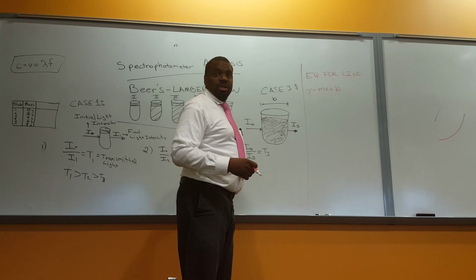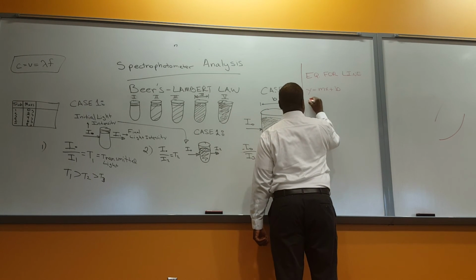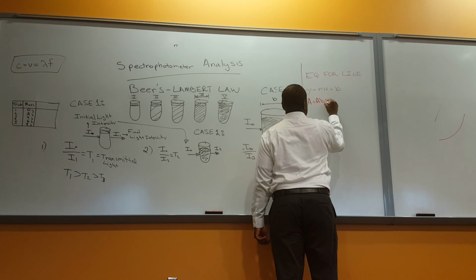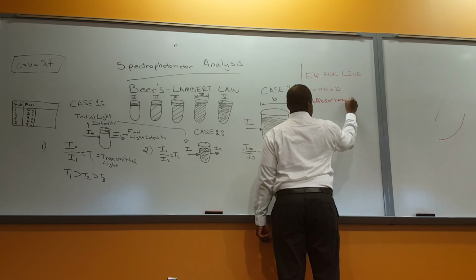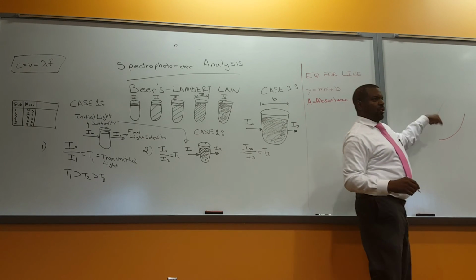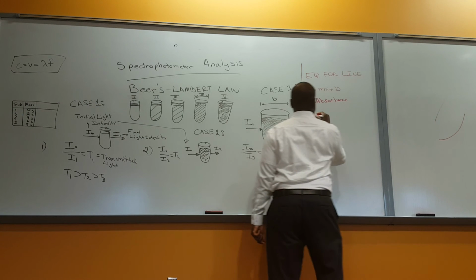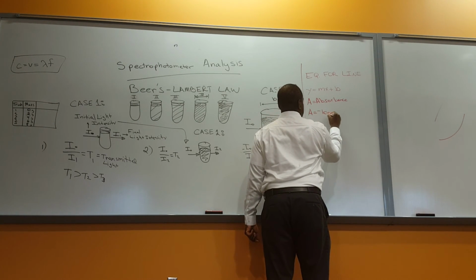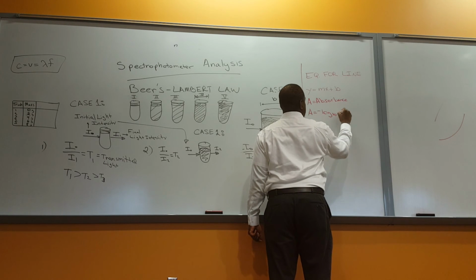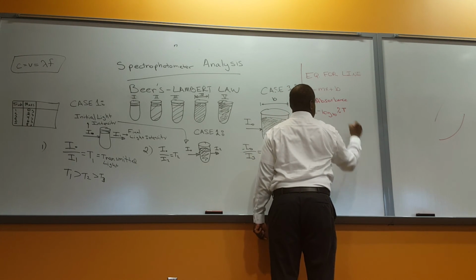I'm showing you what the machine's doing in the background, right? So you've got A equals absorbance. How much light is absorbed? Absorbance. And to straighten these, sometimes you get these curvy lines when you're taking the data, you take the negative log, right? So A equals negative log base 10 of the percentage of the transmittance, right?